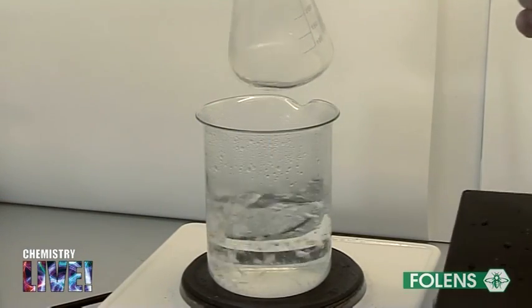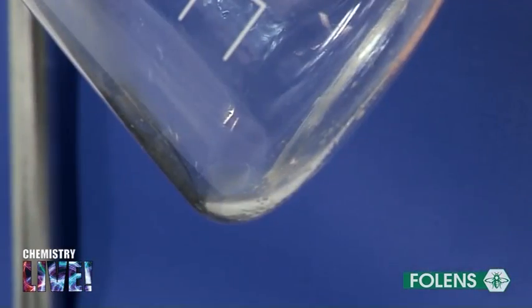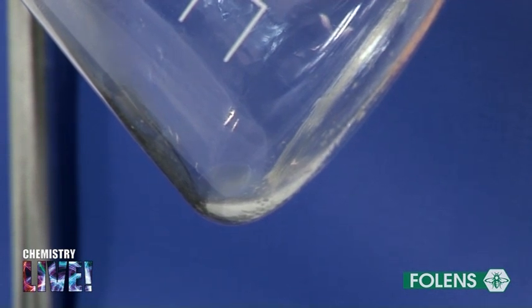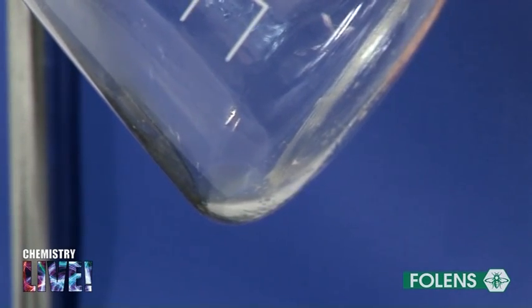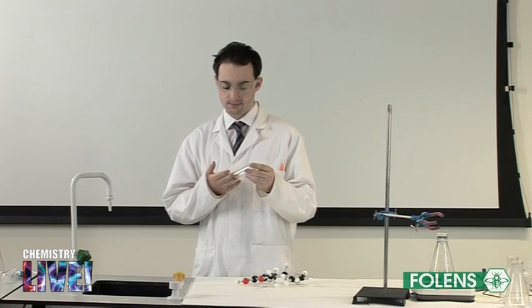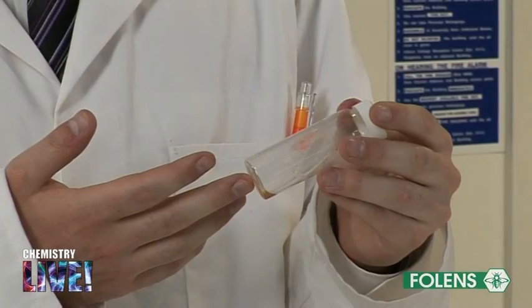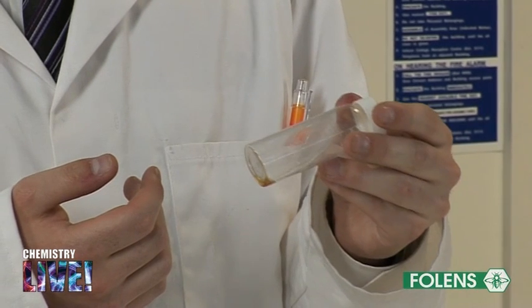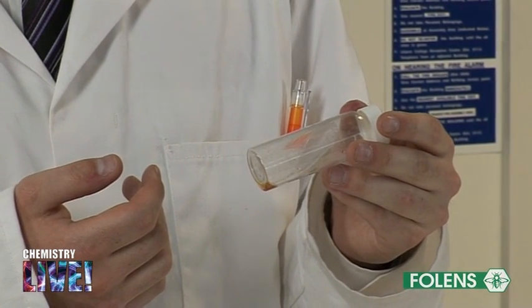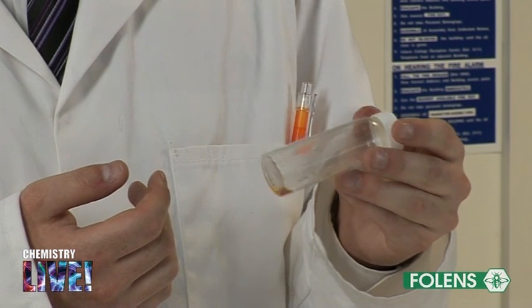Note at this stage that most of the cyclohexane has boiled off. Allow the conical flask to stand overnight in the fume cupboard to allow any remaining cyclohexane to evaporate. Note that a small quantity of an oily substance is isolated at the end. The amount of oil is small as we've carried out the experiment on a small scale.